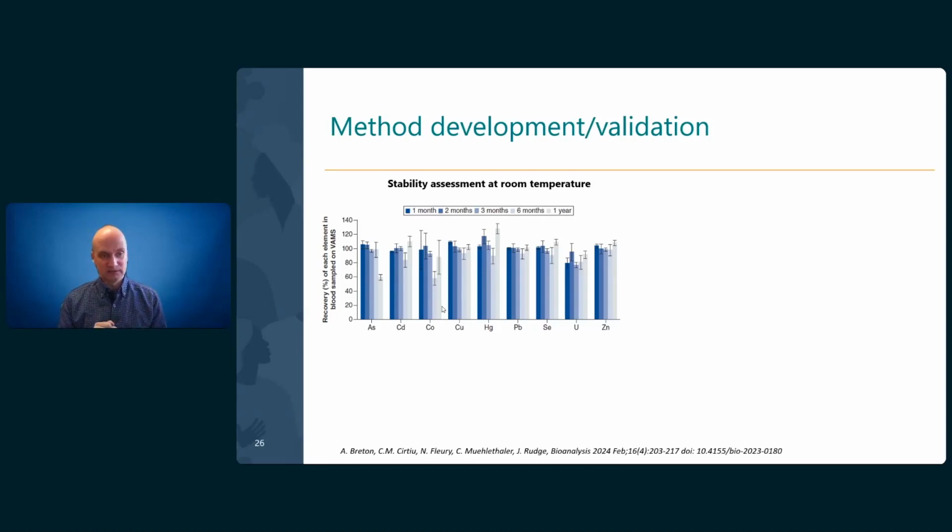So by applying a higher blank, the results are obviously impacted, and that's why we get, let's say, a loss of arsenic after 1 year. But roughly after 6 months, we're still quantifying with very good results. So we're not worried about it.